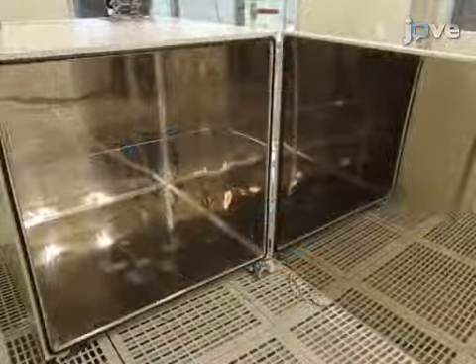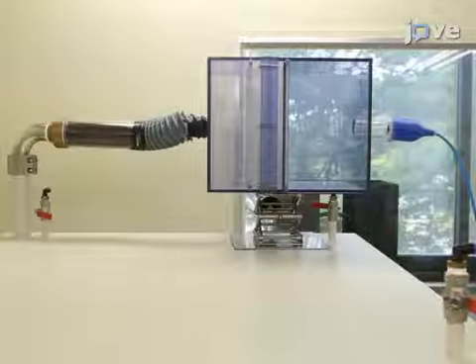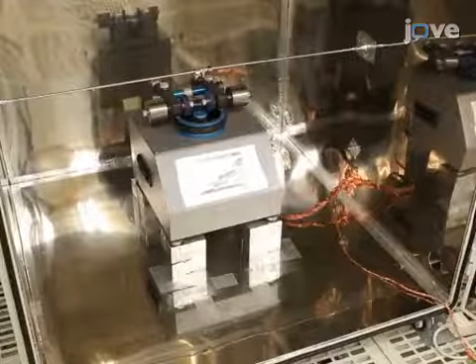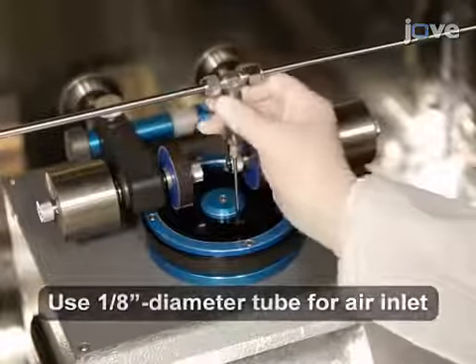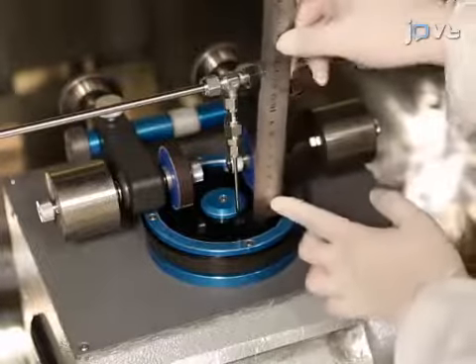Use stainless steel for the chamber walls to avoid particle deposition due to electrostatic force. Locate the air inlet and outlet in the upper and lower part of the chamber, respectively. Place the abrasor inside of the chamber, and install an additional air inlet in the abrasor that is 15 mm above and 40 mm away from the center of the test specimen to provide better suspension for the abraded particles.